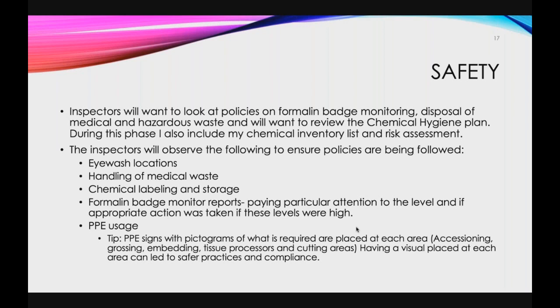The inspector will observe the eye wash locations, the handling of medical waste, the chemical labeling, and they will look for the formalin badge monitor report. They will pay particular attention to the level. So they will look to see: do you know your level? And was appropriate action taken if these levels were high?